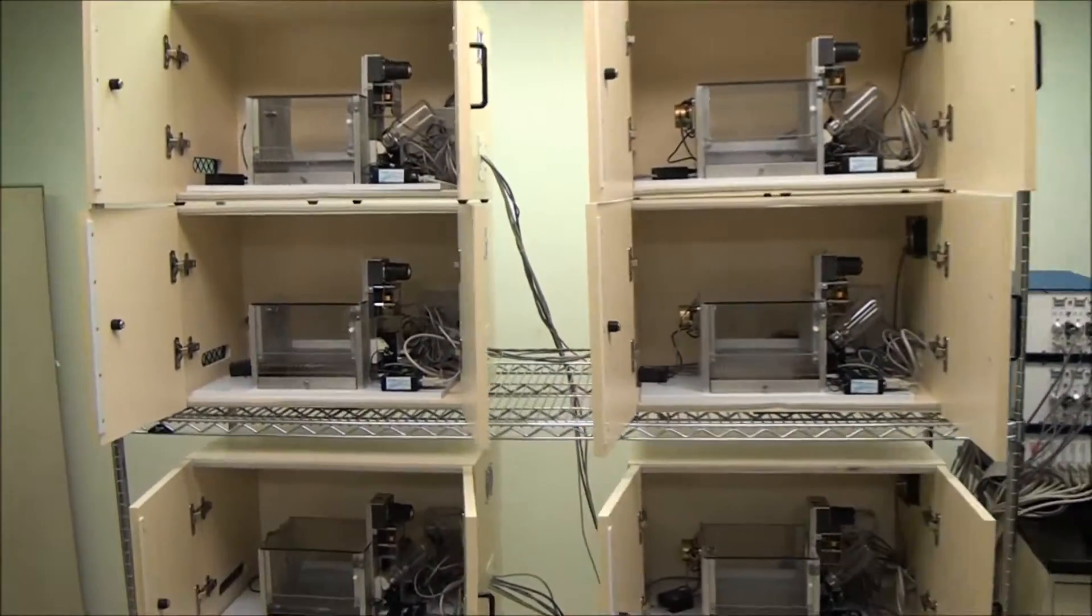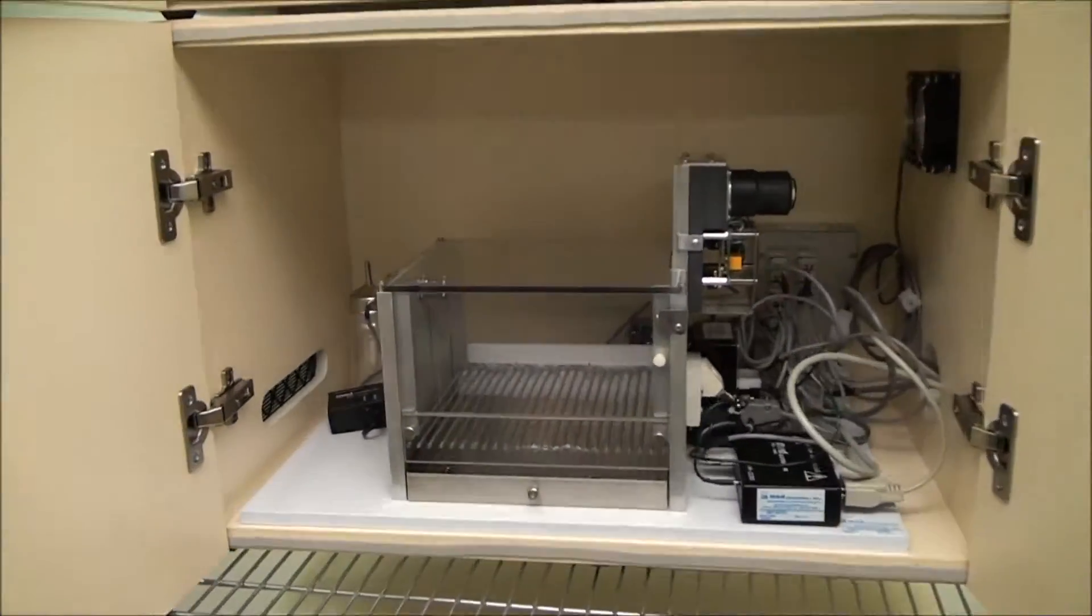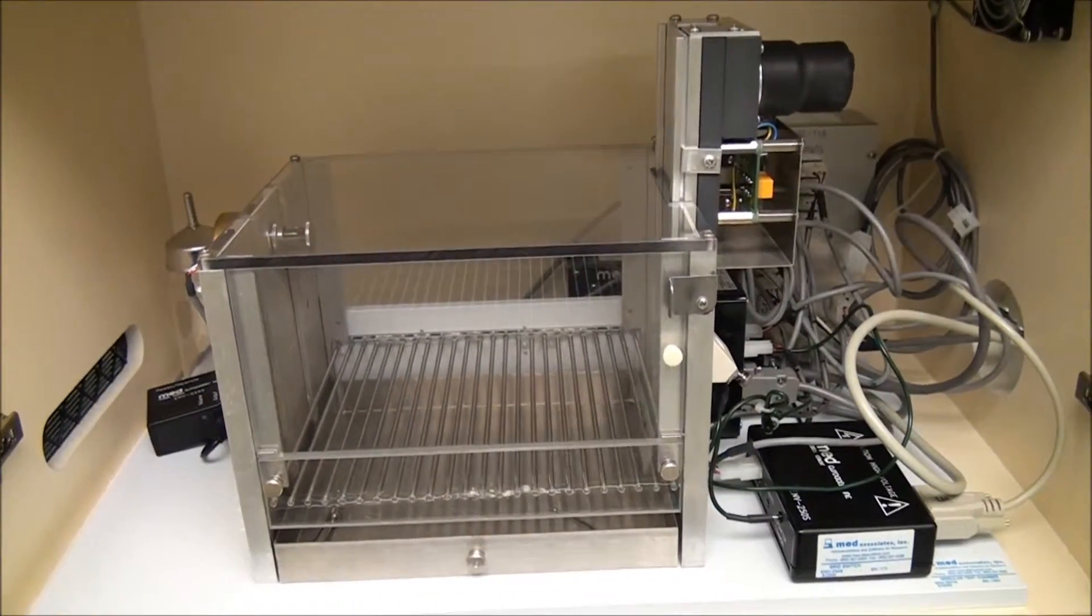And I'm going to move up on these units and kind of show you exactly what all they have besides that. You can see they're all identical. There's eight chambers in total.